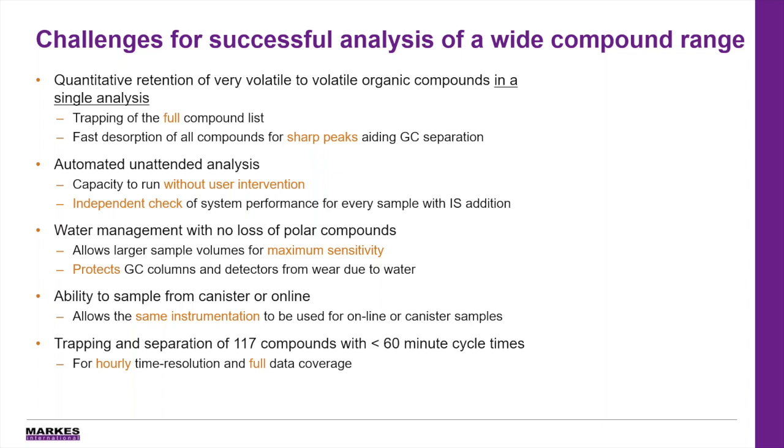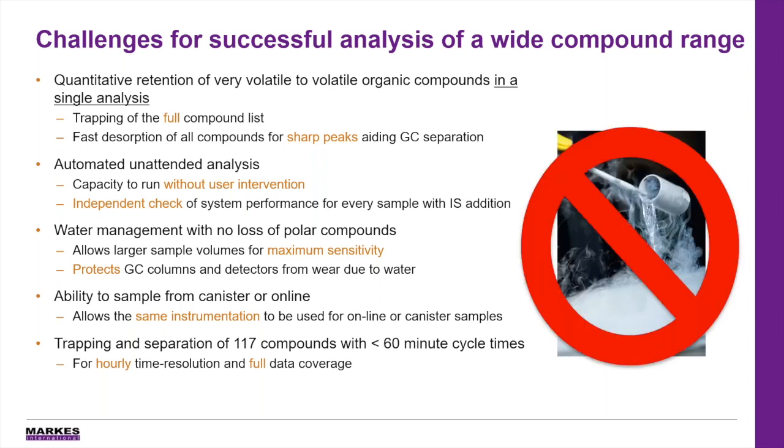And of course, we need to achieve all of this with a cycle time less than 60 minutes. It's really important in specific air monitoring applications that you get good time resolution. So you can have a data point every hour and see the changes in the VOCs as the day progresses. And we need to do all of this without liquid cryogen for either the trapping or the chromatography.